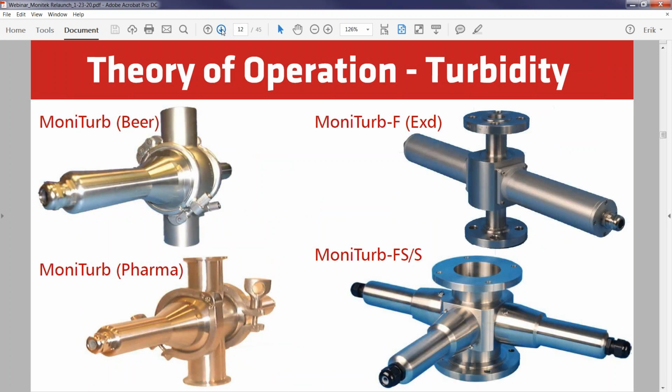So here's a couple examples of different flow cells that we would use. So if we talk food and beverage or pharma, I think everybody's seen these at one point in time of dealing with instrumentation. That top left one, that's a typical one that would be used in a brewery or in food processing.